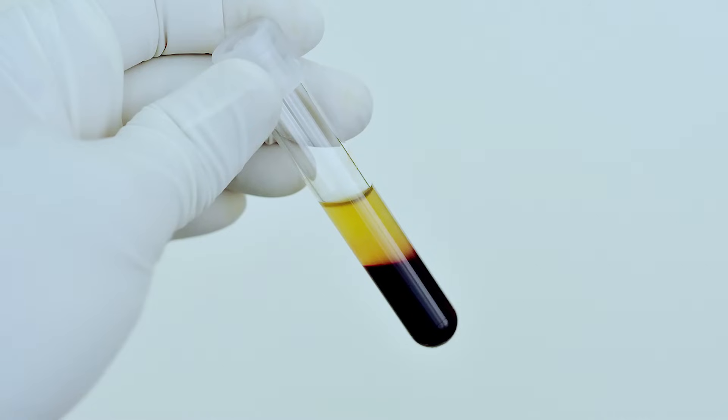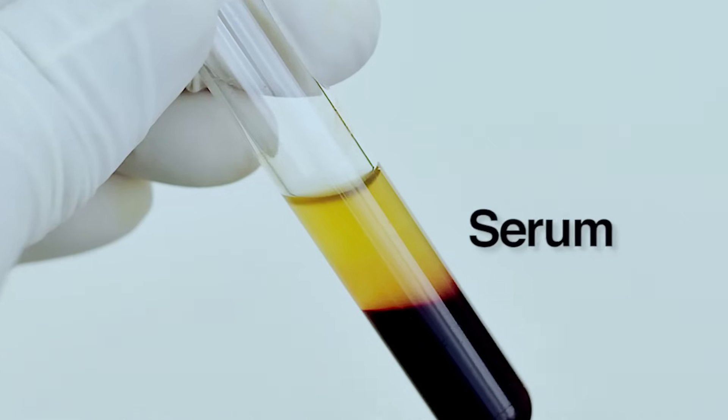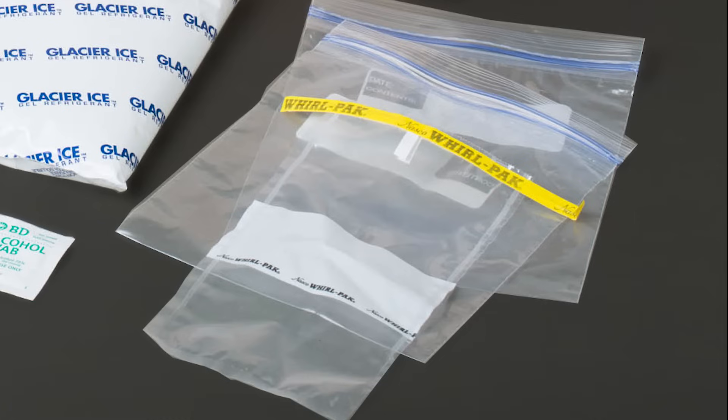There are two main components of blood: the red and white blood cells, and the clear yellow serum portion. Most antibody tests will utilize the serum component of the blood sample, so you'll want to allow the blood to clot, which separates the cells in the blood from the liquid serum. So don't use blood vials that contain an anticoagulant such as heparin.